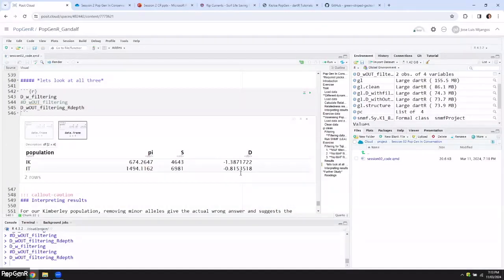I had just one thing to add, which I mentioned to Bernd earlier: one shortcut that I sometimes use for analyses is to do correlations while I'm filtering. So you have your quality metrics or quality filters like call rate, read depth, repeatability, average, and none of those should be correlated with any kind of biological metric. So sometimes I use that to gauge how much to filter. If FIS is correlated really strongly with call rate, maybe you're losing heterozygotes, and then bump that up until you don't have a correlation.